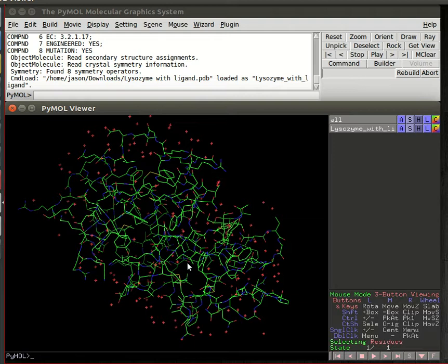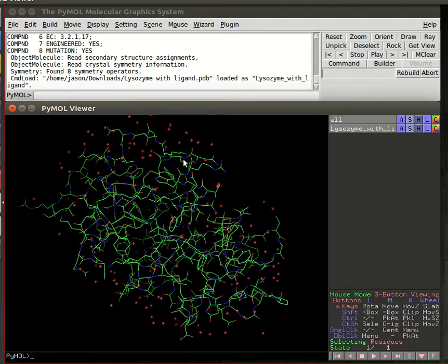There's a lot you can do with PyMOL, and of course what you decide is a good figure is to some degree subjective, but as long as it conveys the information in a clear manner, that's fine. You may have different preferences about color or background or transparency. All of it's valid, as long as, like I said, you can make out the information that's meant to be conveyed.